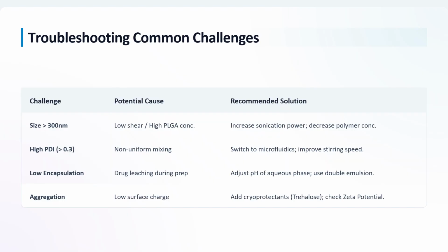During nanoparticle synthesis, several practical challenges may arise. For example, particles larger than 300 nanometers often result from insufficient mixing energy or excessive polymer concentration. Increasing sonication power or reducing polymer concentration can help address this issue.